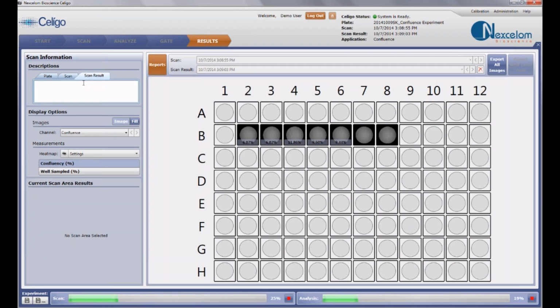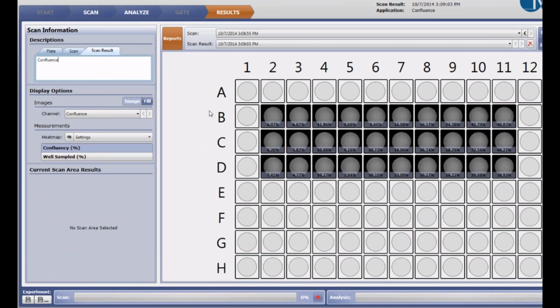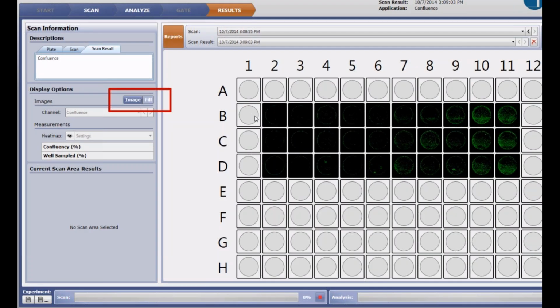This is a scan tab that is unique to this scan ID. Yesterday's scan would have had the same details that it had for the previous day. So this is a new scan. And you can see that the results for this second scan, it's technically the same because I actually didn't really wait for 24 hours. But here you can see the fill icon is working the same way as I just imaged it a few minutes after I had imaged it the first time.